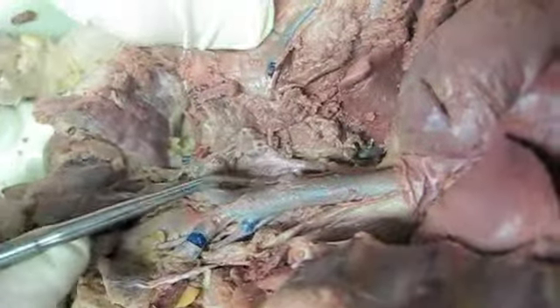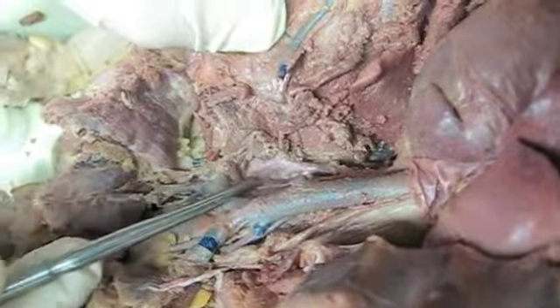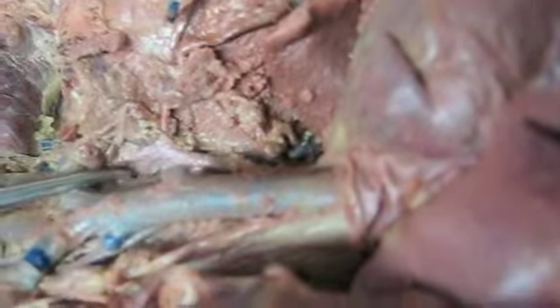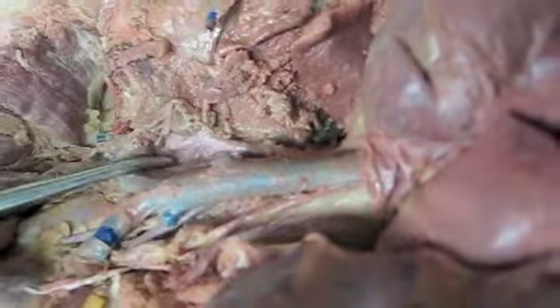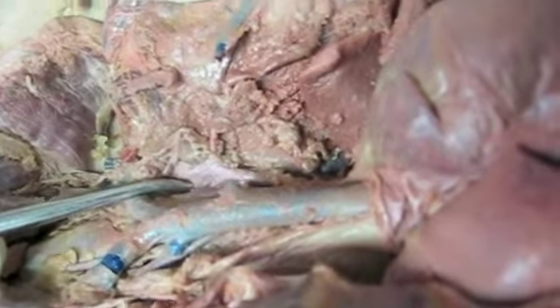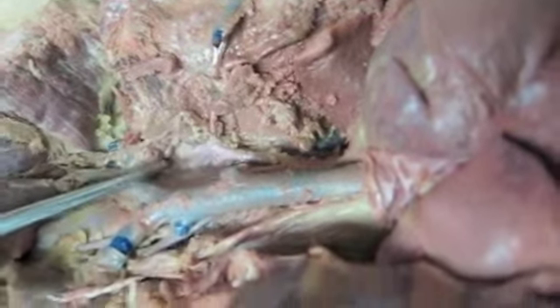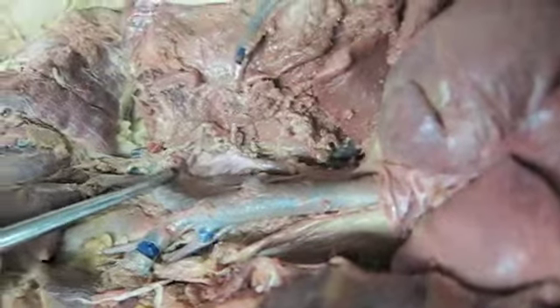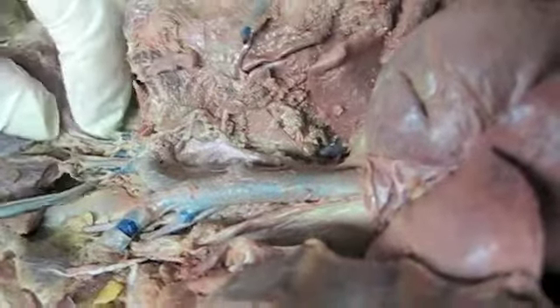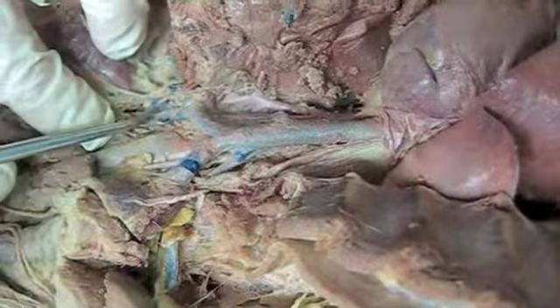And then just ahead of it, up here, coming off and going down deep, I haven't separated that very well, but this is the costocervical artery. And then the third branch off the subclavian there is called the thyrocervical artery, which gets buried a little bit here in some of these by some of the veins.